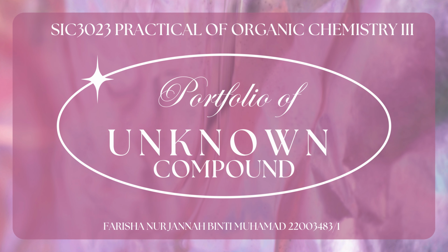My name is Farisha Nurjana binti Muhammad and today I'll be presenting the identification and characterization of my unknown compounds in my binary mixture through this experiment. So in this video, I will walk you through the techniques that I use, including IR and NMR spectroscopy, as well as the reasoning behind how I identify both unknown compound structures.